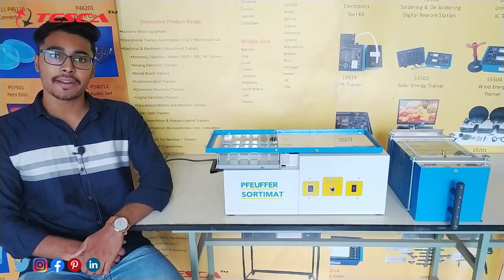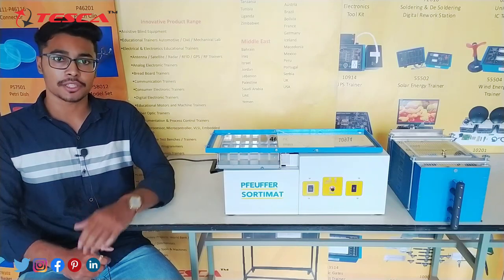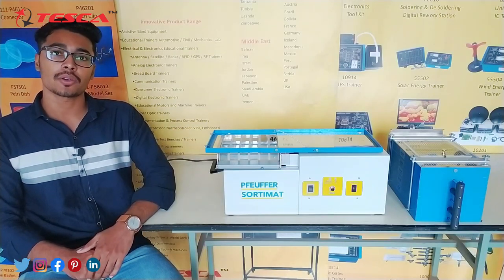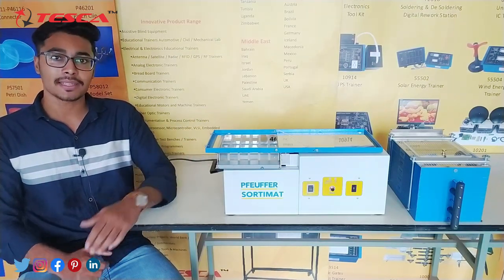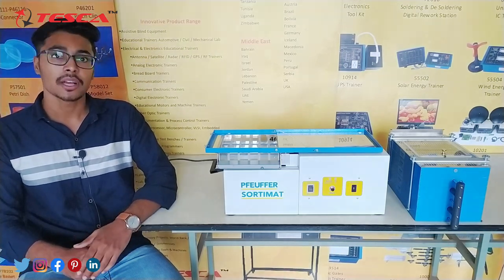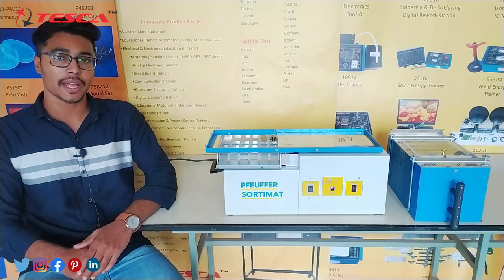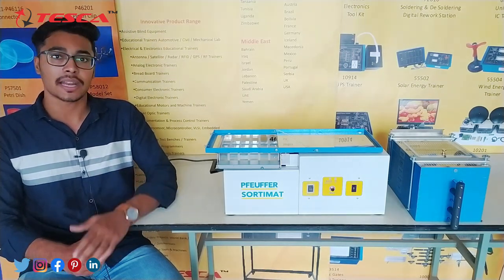Welcome to Tesca Technology Pvt Ltd. My name is Ashim Dutta and today we are going to discuss about the sorting machine. In this video we are going to discuss how to assemble this apparatus, its working, its body parts, and its application. The main application of this apparatus is we use it for sorting and classifying agricultural grain crops.